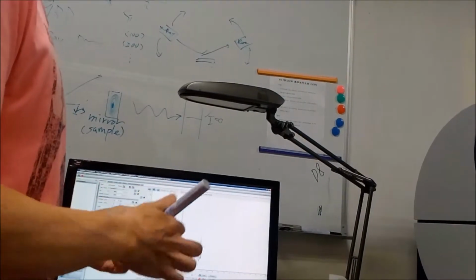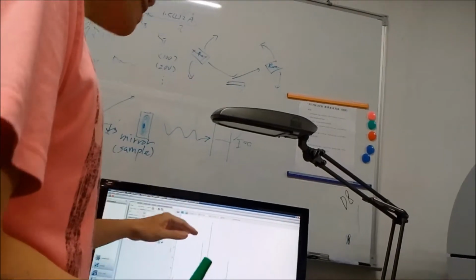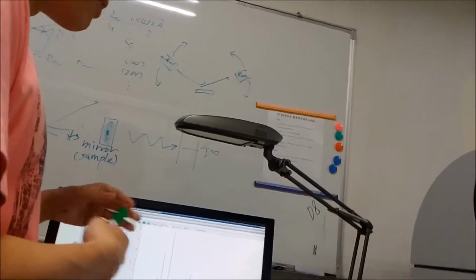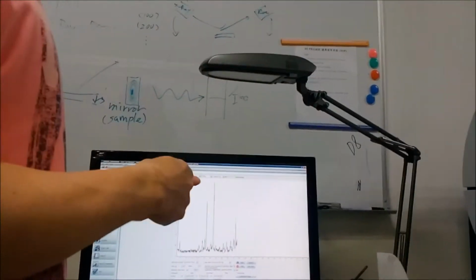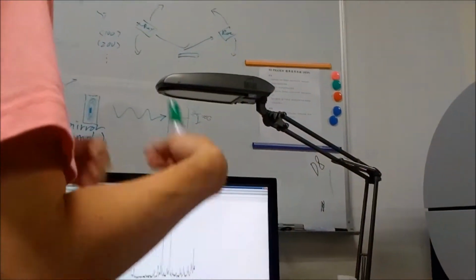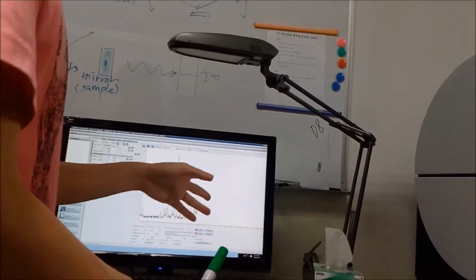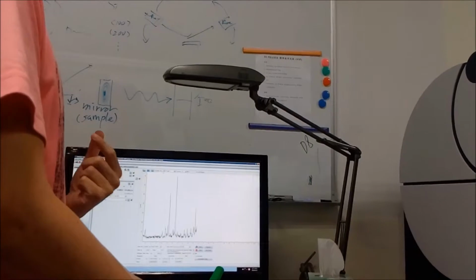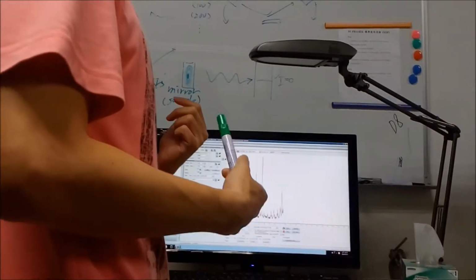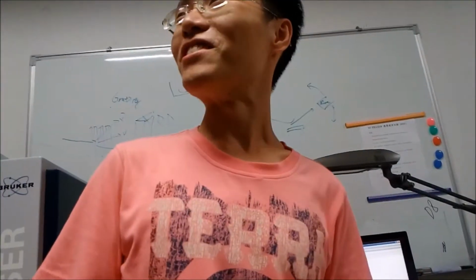You need to use single crystal diffraction, because in this case it's just a pattern. We use single crystal diffraction to calculate its structure, and use this structure to calculate what the pattern should be. And we just use this to confirm our result. You know what I mean? My English is very poor, so if you don't understand, just let me know.